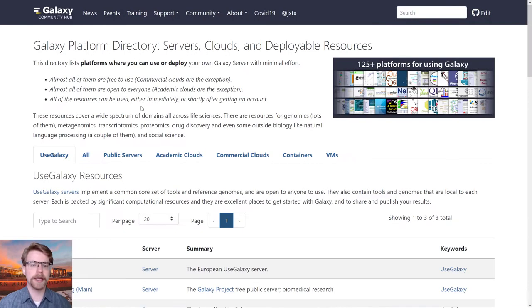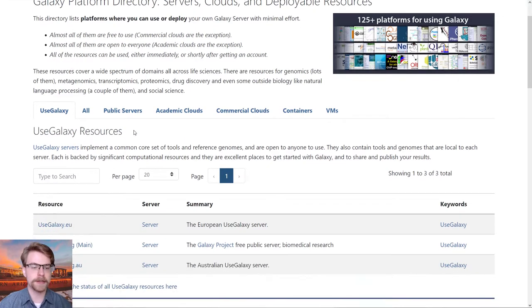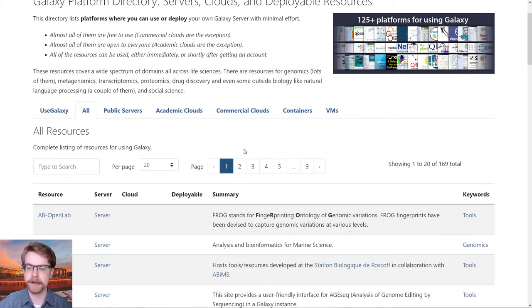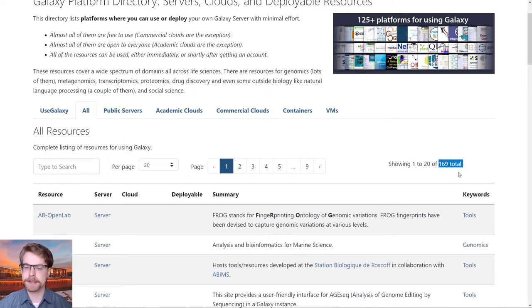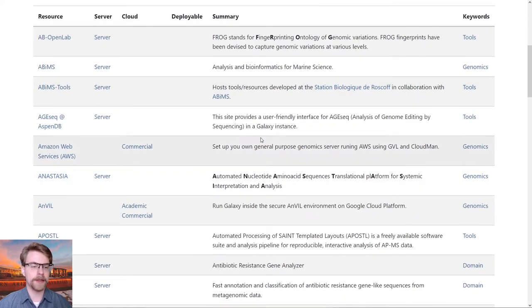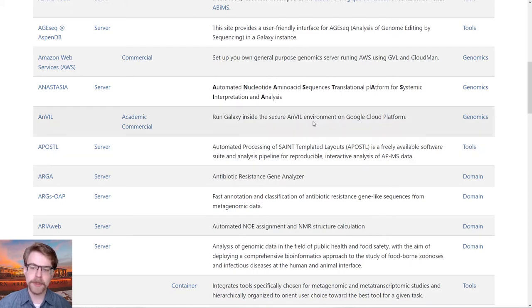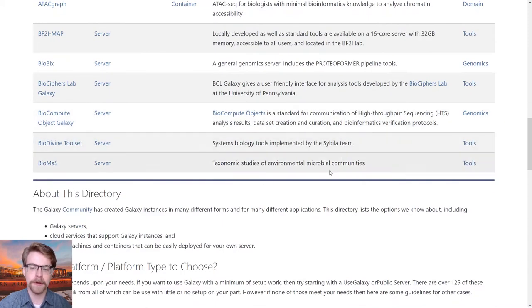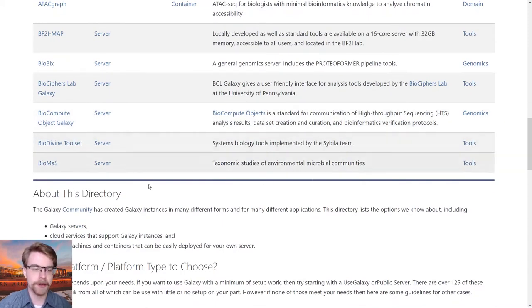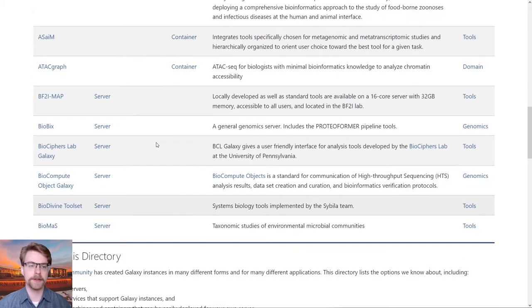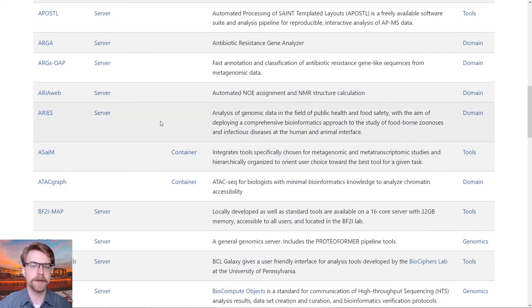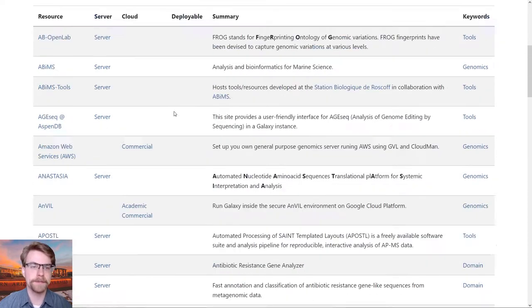If we look at galaxyproject.org/use, we can see all of the different Galaxy servers which are publicly available. You can see there's over 169 of them, and they range from everything from using Anvil on the cloud platform to taxonomic research or biocompute objects. There's all kinds of tools out there, and each Galaxy server is going to be a little bit different.